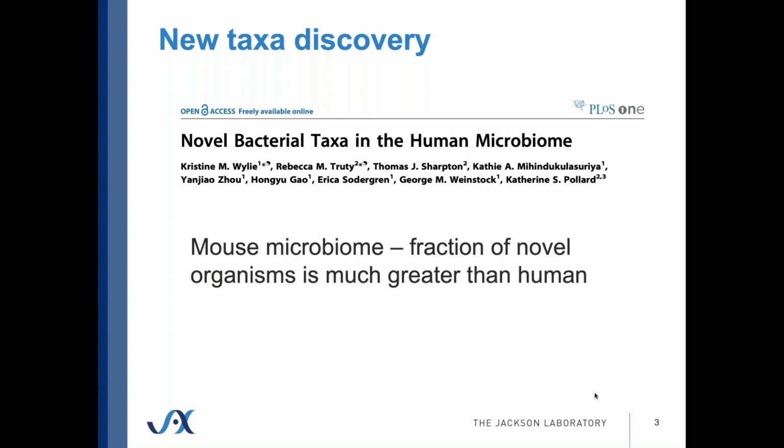And we really had to stand on our heads to answer that question, because using the 454 16S sequencing that was done then, there's a lot of chimeric sequences, a lot of other artifactual sequences. So when you find things that are not in databases, it turned out that overwhelmingly, meaning greater than 90%, maybe 99%, were some kind of artifact. And so we had to use a combination of short reads from Illumina and medium-sized reads from 454 in order to answer the question, how many of those sequences are for real? And as you'll see later on, this is actually much easier to do nowadays than we had to do it then. The answer, by the way, is that because there's been so much work on the human microbiome, there's relatively few new sequences that we run across at the level of sampling that we do for most microbiome experiments now. There's still some, but relatively few.